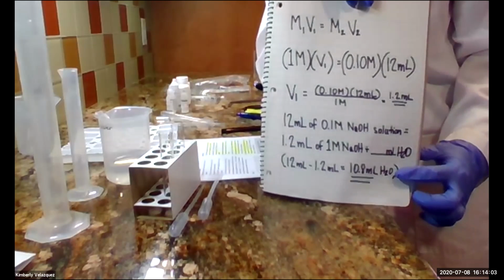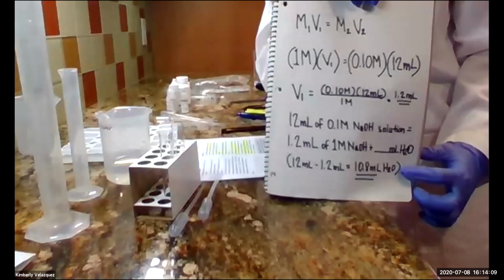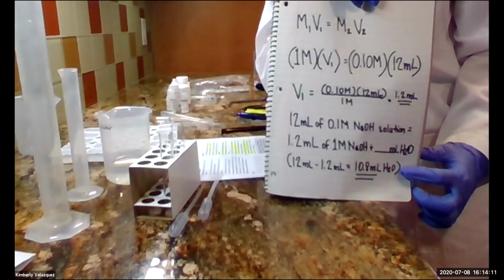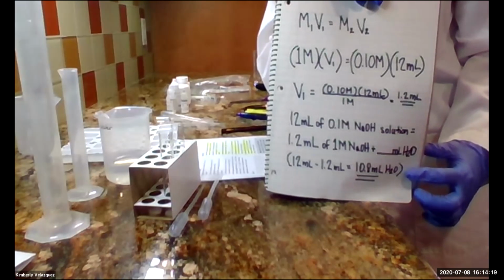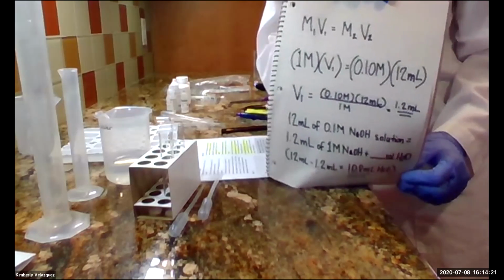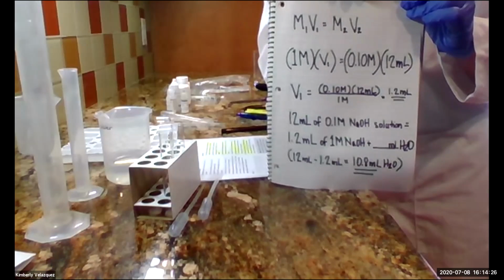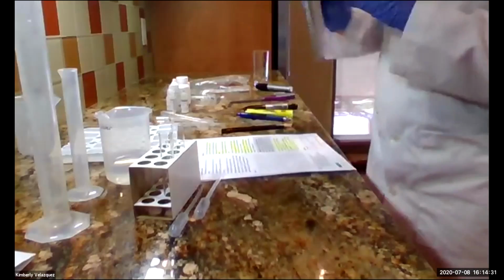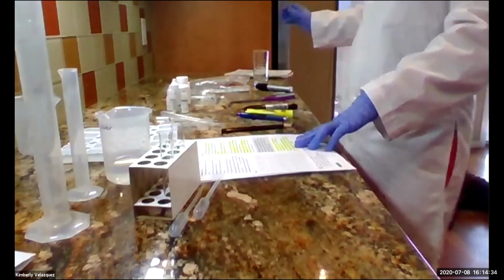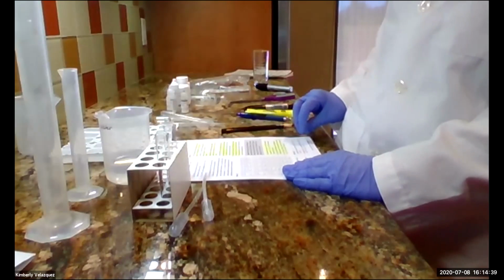Here's the second part of the equation. I'm going to be adding 10.8 mils of water to my 1.2 mils of sodium hydroxide to get the total solution. I'm actually going to post this calculation on Canvas so you can see this, because it's kind of hard to see right now. You're going to do the same calculation for hydrochloric acid, and it's the same numbers.